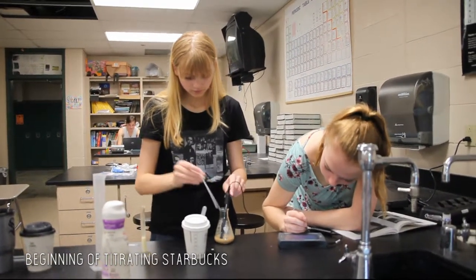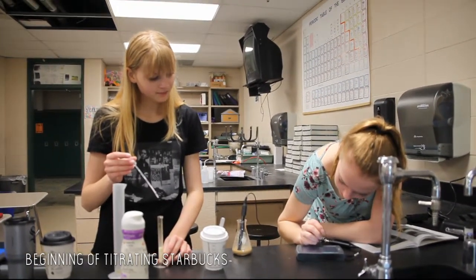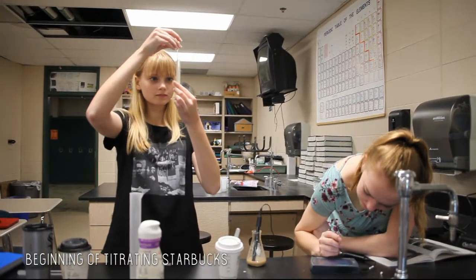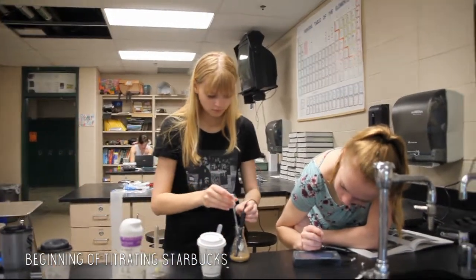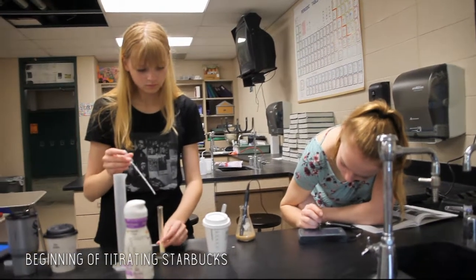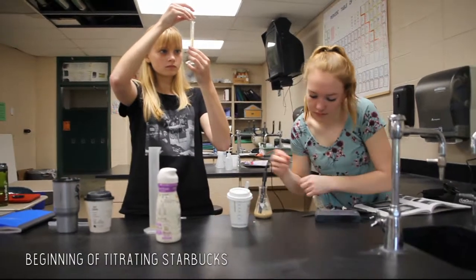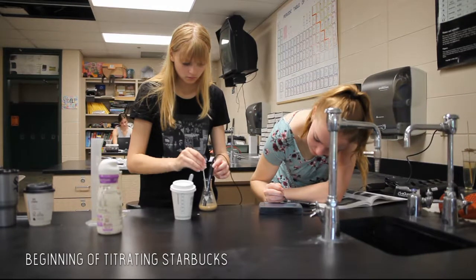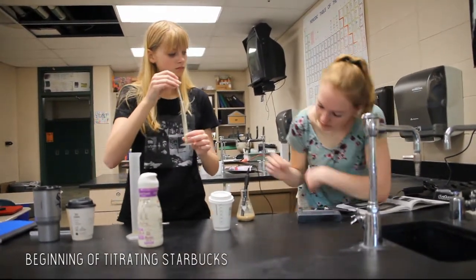This brings us to a very important topic — things we should do differently if we were to repeat this experiment. First of all, it would have been better to do this experiment on a hot plate and with a stir bar, like we do with normal titrations, in order to better and more thoroughly mix the coffee and creamer together. It didn't help that we didn't think to swirl the flask until a little bit of the way through the first titration with the Starbucks coffee, so that most likely skewed our initial pH recordings just a little. Second of all, in order to get more accurate results, it probably would have been a good idea to repeat the experiment multiple times.